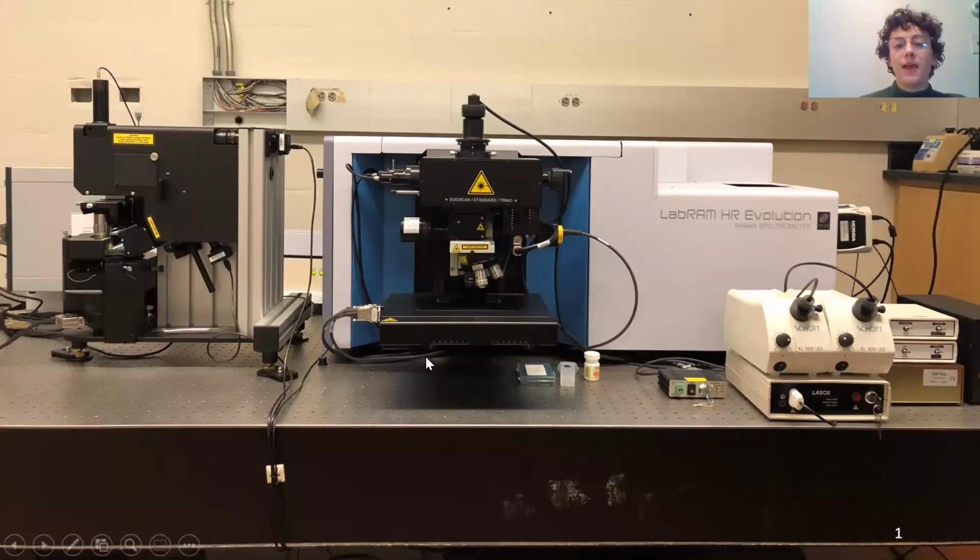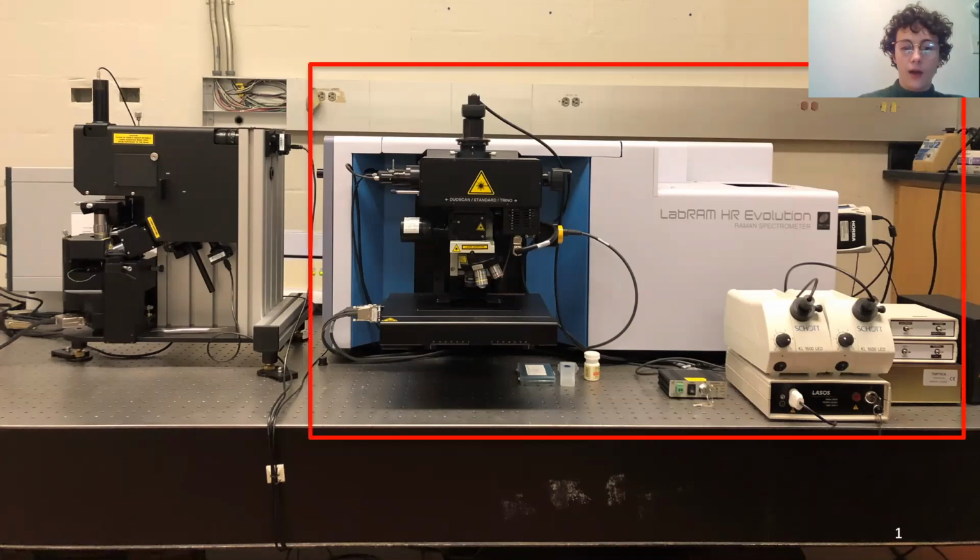It's comprised of a Horiba LabRAM coupled to an OmegaScope atomic force microscope. Each side can be used individually or they can be combined. On the Raman microscope side, you can collect Raman spectra of bulk samples, confocal Raman images, and ultra-fast Raman images when using SWIFT, which is just a special detector setting.